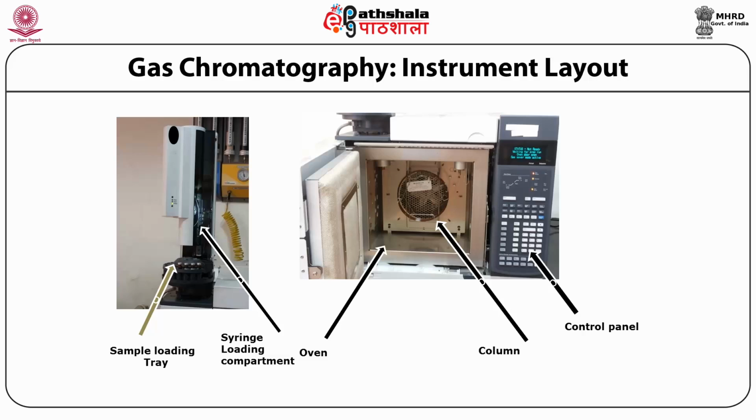that you want. All of this, of course, will be connected to the user interface for the software that runs the whole chromatographic process, along with the software that allows you to do the final editing of the readouts that are obtained.